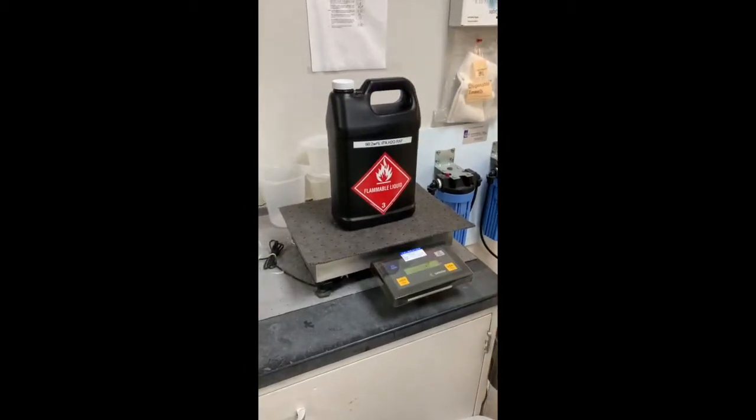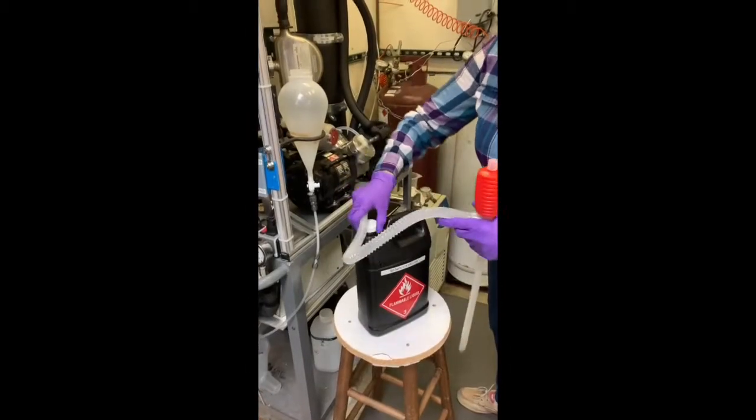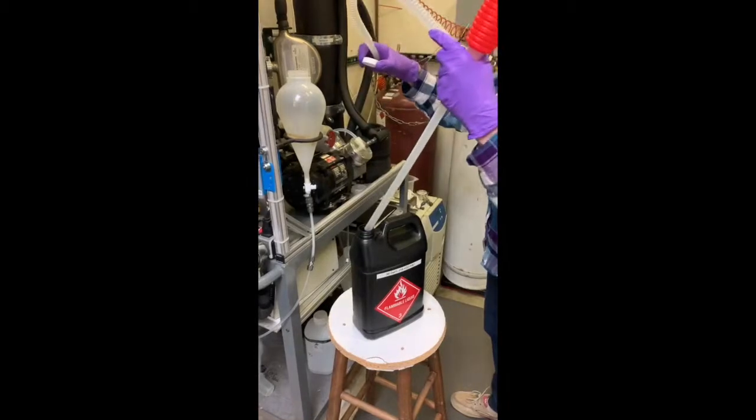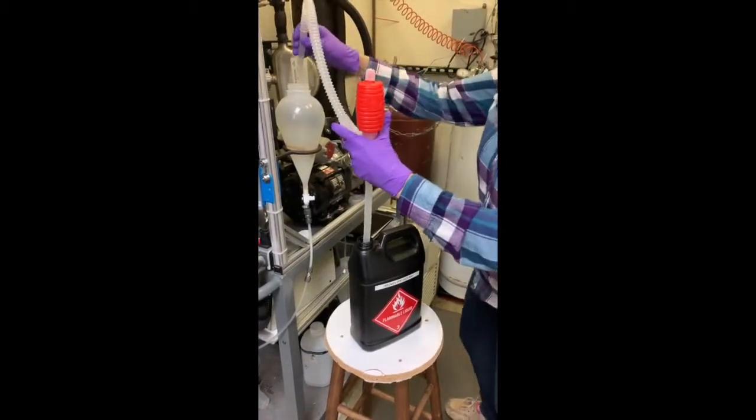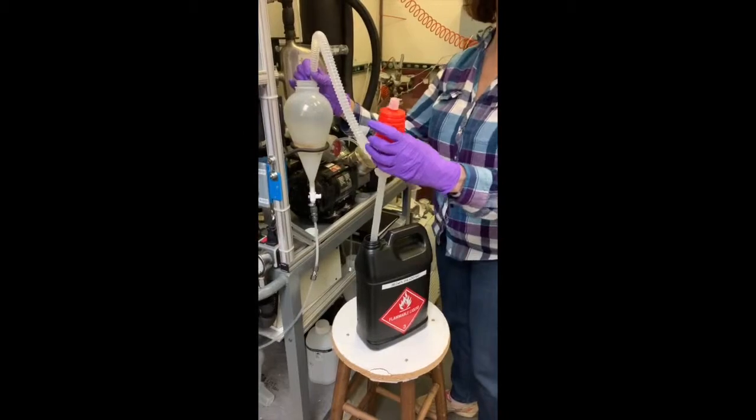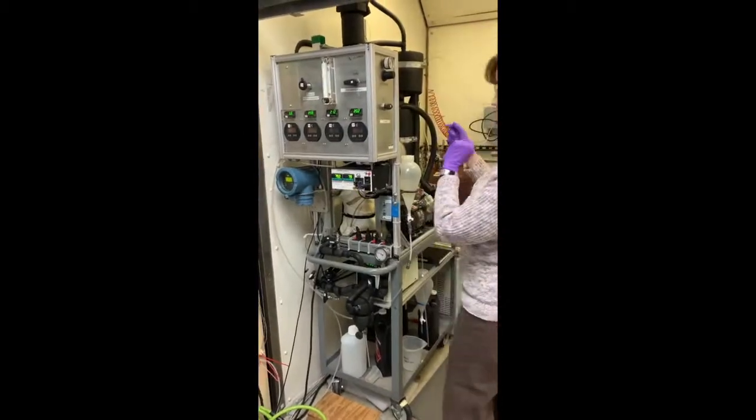The feed sample is weighed before it is placed into the system. Once the system is filled with the IPA water mixture, it is left to heat until it reaches the desired temperature. The membrane is bypassed during this procedure so no separation occurs at this time.